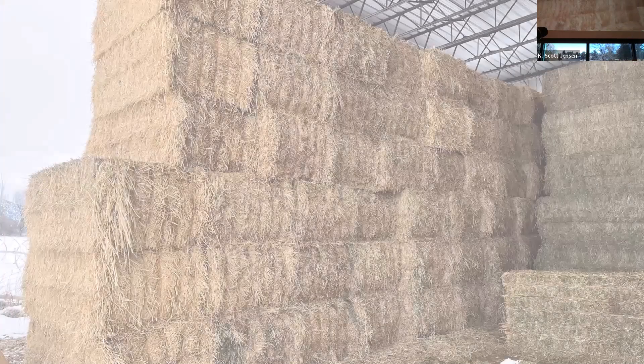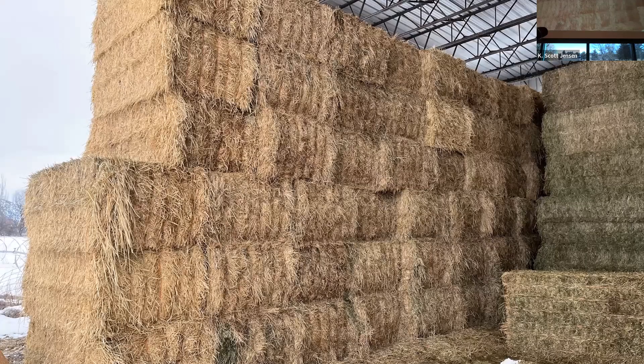Also worth mentioning: on most forage probes you'll find a ramrod, because they will get clogged up. I try to push everything down the bore about every two bales. You do one sample per bale.